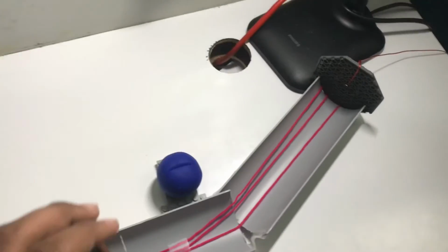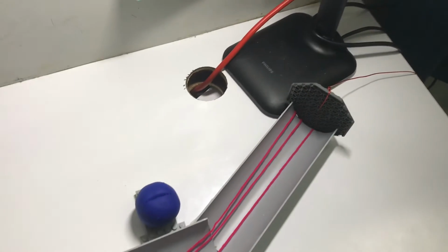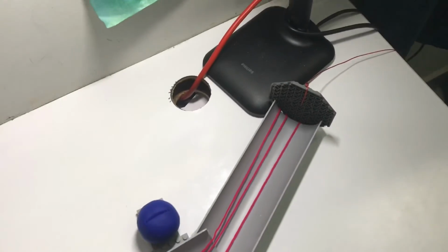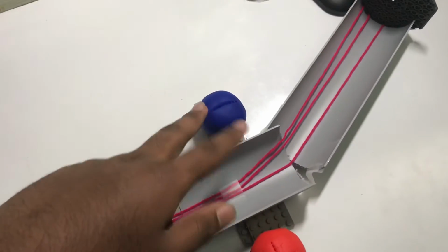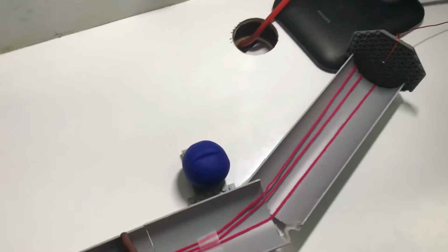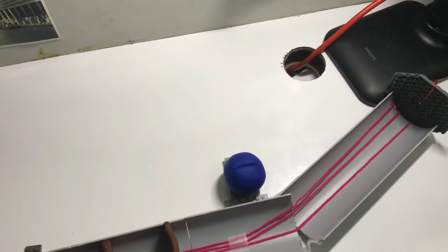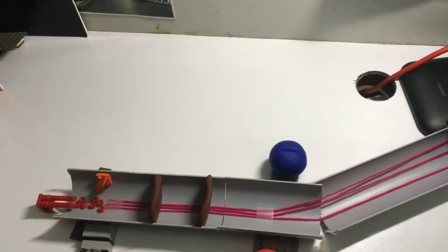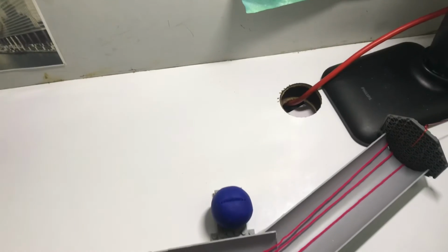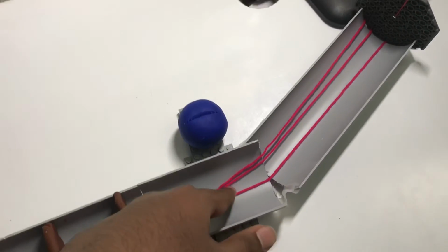In the second part, we reach the last two stages of the mass spectrometer process. The fourth stage is deflection. Basically, this is where a magnet, represented by the positive and negative clay balls, deflects or changes the trajectory of the different weighted positive ions. So the less mass an ion has, the more it will deflect, as we can see by these two lines here. These definitely have a different trajectory as compared to this one.